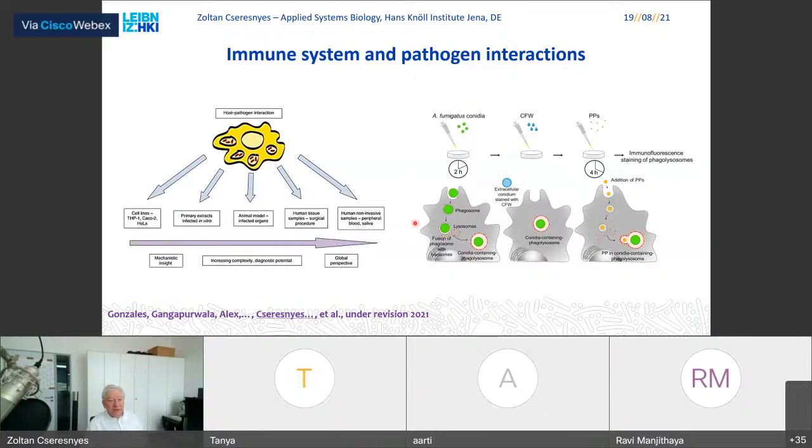How are the experiments carried out? We deal with tissue, and I will talk about this briefly, from simple environments where we use cell lines, all the way to animal models, organs, even extracted human tissue, and also intravital or in vivo human experiments with non-invasive microscopy methods. We will not have time today to talk about all of these. I just wanted to give a quick summary of the scale that we cover in our research.